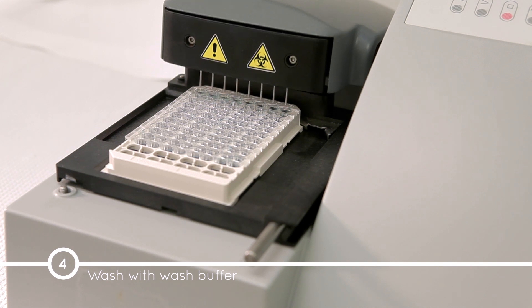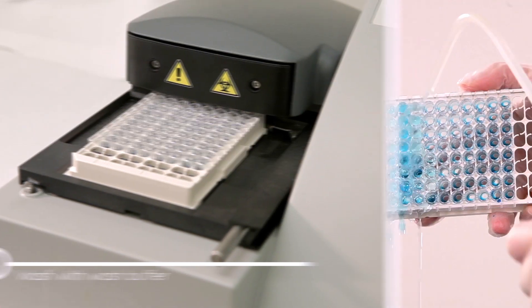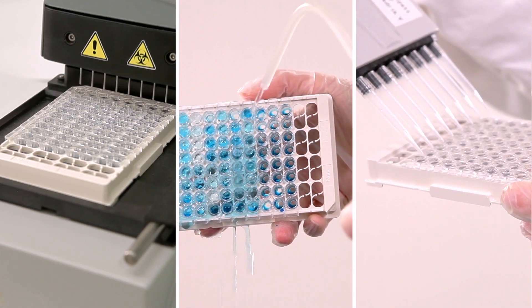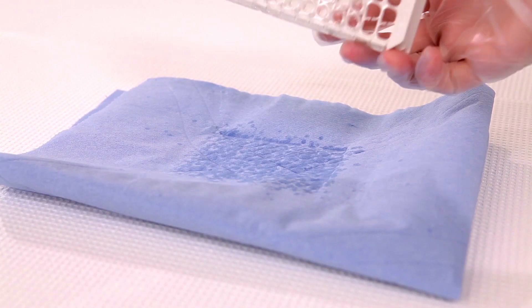Alternatively, the plate can be washed manually using a squirt bottle or a multi-dispensing pipette. After the final wash, invert and tap the plate firmly against absorbent paper.